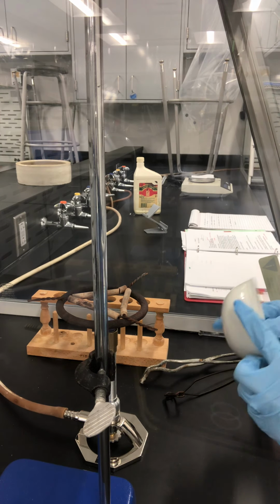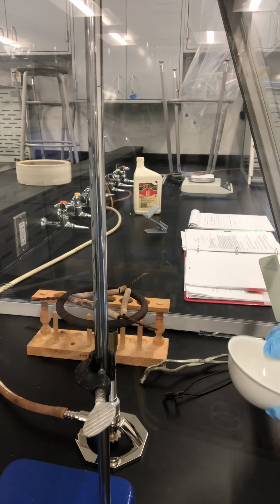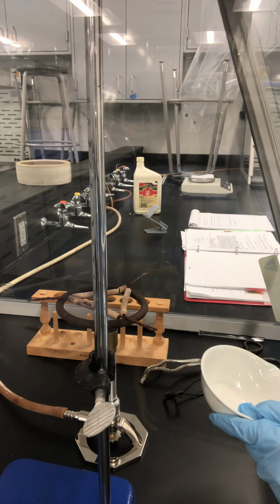This evaporating dish by itself is 87.15 gram. You need to write this number down in your lab manual.